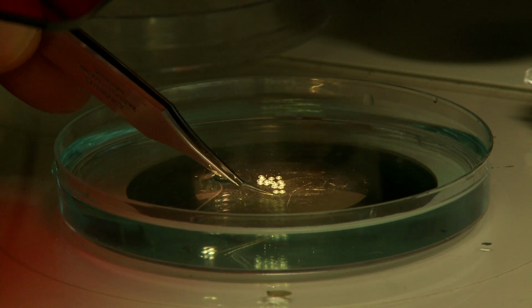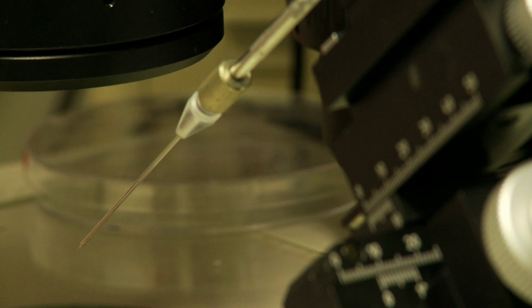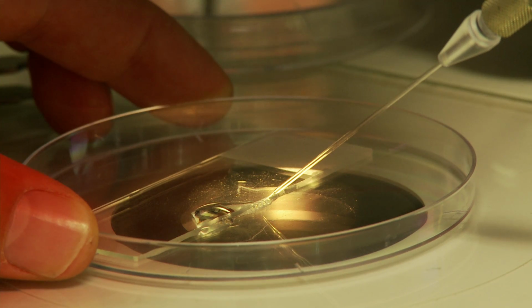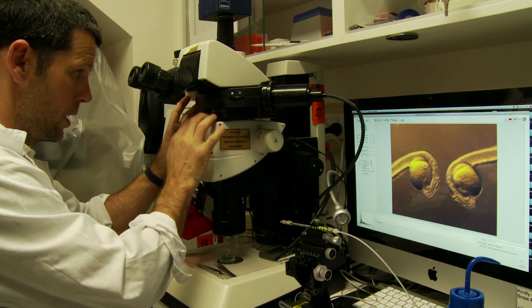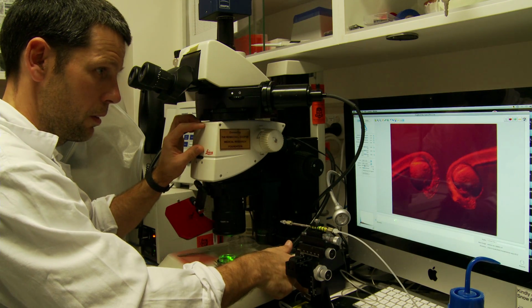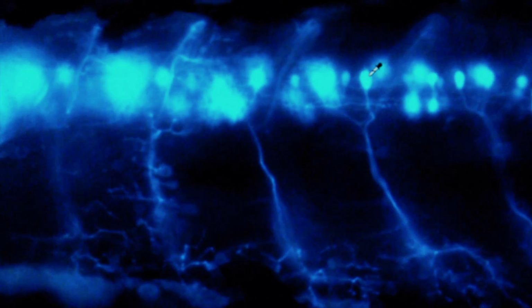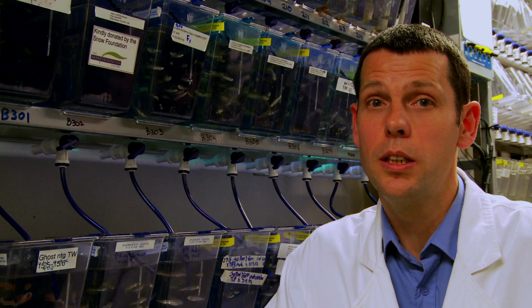And we would also spend our time analysing our fish. So once we've got the fish to express the normal and the mutated genes, for example, we can then analyse the whole swimming performance of the fish. Do they locomote normally? Do the neurons fire normally? For example, we can look at motor neurons and neuromuscular junctions and investigate whether or not we have in fact got a motor neuron disease phenotype. By this I mean, do the fish show signs of motor neuron disease?